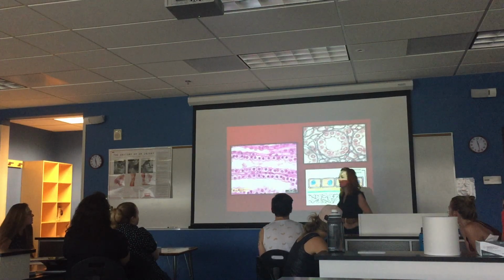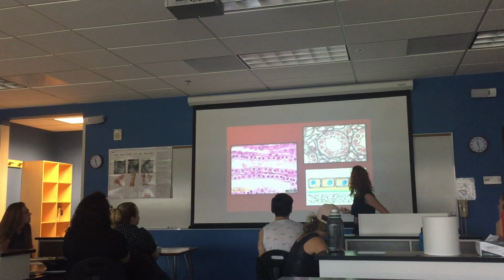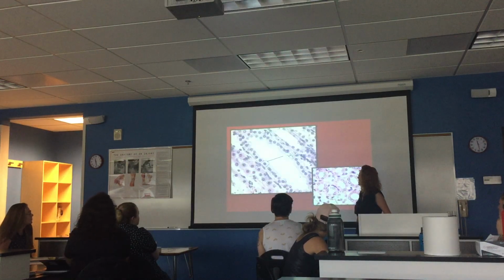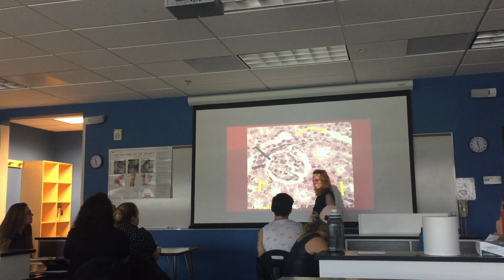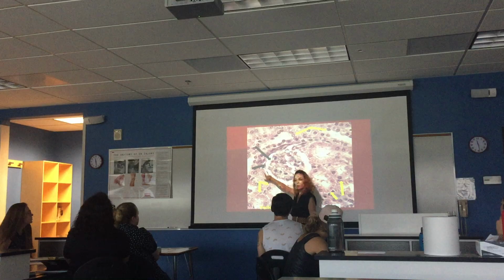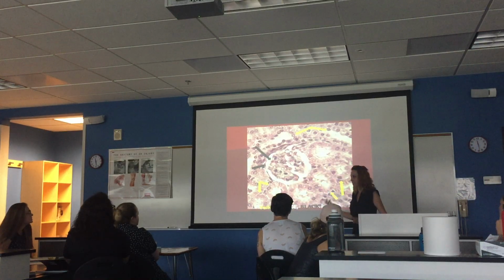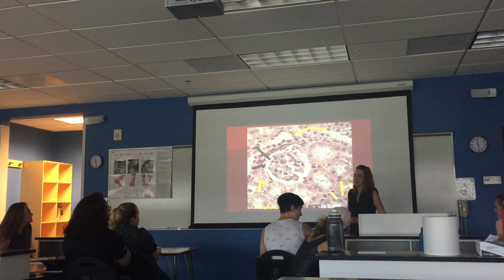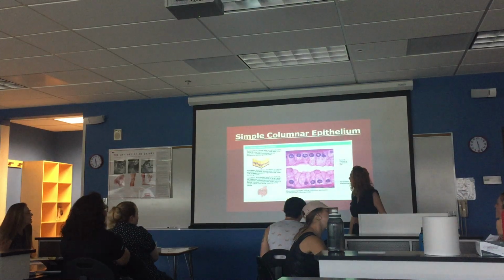These ones are easy peasy, you guys. Can't mess this one up, in my opinion. Okay? To me, it's just like easy, easy, easy. Cool? All right. So this is me telling you again, on your slides, probably, possibly, 100%, you will see multiple different things on your slides. And sometimes you'll see things that we can't identify because I'll just call it connective tissue to be safe.